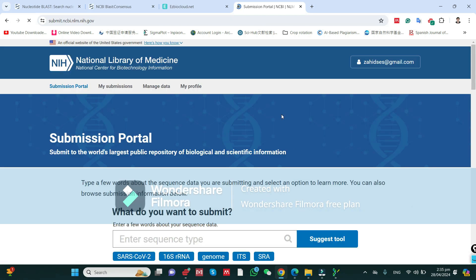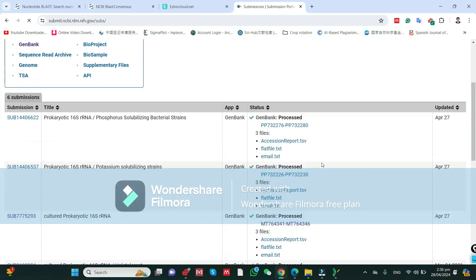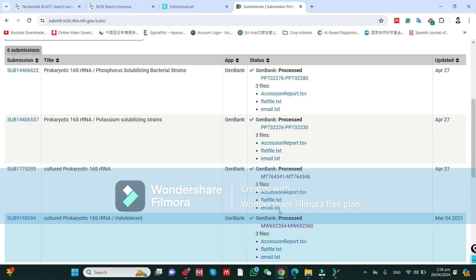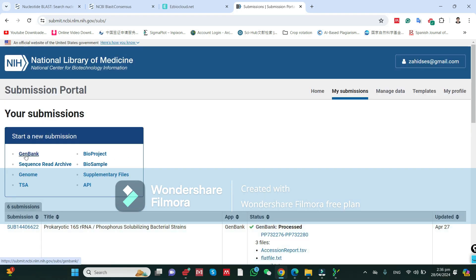My ID is logged in now. It will show the submission portal with tabs: My Submission, Manage Data, and My Profile. You can see all these tabs. Under My Submission, if you have already made submissions they will show here; if you do not have any submission it will not be shown. I want to submit a 16S rRNA sequence to GenBank so I will click on GenBank.